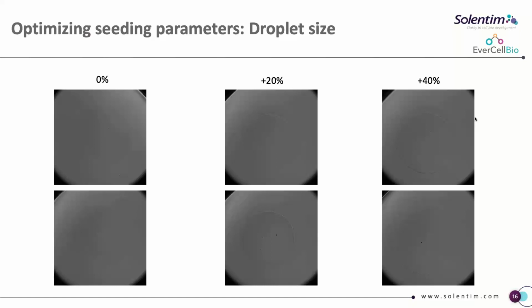So we found this very nicely and easily able to be adapted within the setup of the workflow upon seeding your initial plates. Keeping in mind that the instrument during seeding can be set to up to 4 droplet attempts per area and up to 4 areas within a 96-well plate.